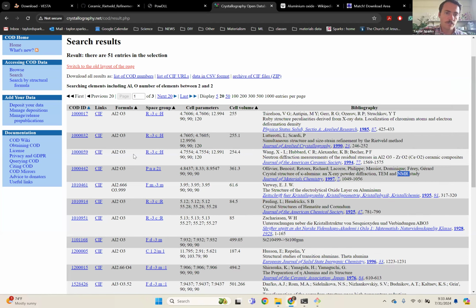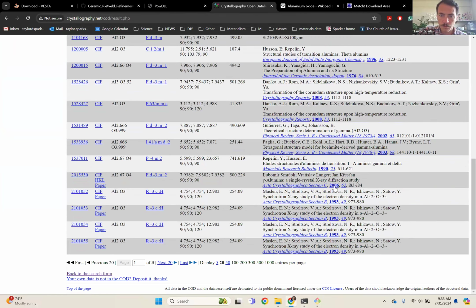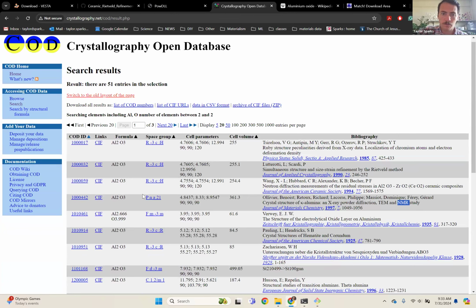So you could check a few others of these. Maybe you'd get lucky and you'd find one that has it refined. If you look at the date of when these were published, more recent ones are going to do better at it. Again, other software would let you rank it by date. Here, I don't see that option. We'll just look at one of these other ones from 94 real quick. Try one more.